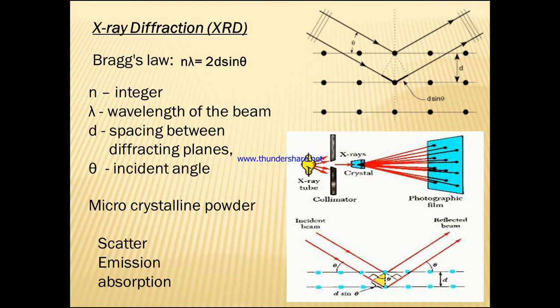The diffracted rays are used for the analysis and give us the results in X-ray diffraction.